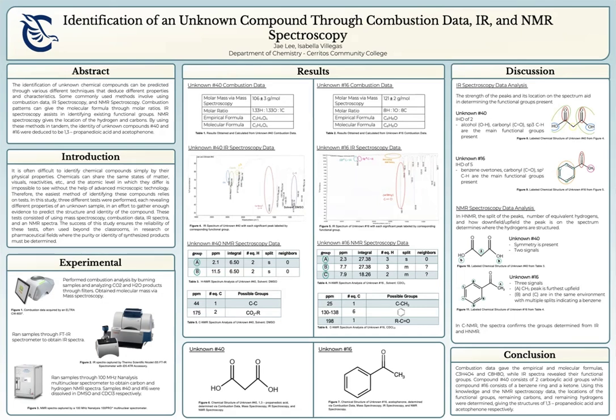being acetophenone. Now, we all know that organic chemical compounds are generally difficult to tell apart or distinguish. They all like to share physical characteristics, whether it's visual appearances, reactivities, or others. It is very hard to identify these compounds, which usually only have atomic differences, which is important because chemistry is used in the outside world, such as research and medicine. By conducting this experiment, we wanted to reinforce the reliability and our understanding of these tests in order to ensure their widespread influence across all fields that involve the usage of chemical compounds.